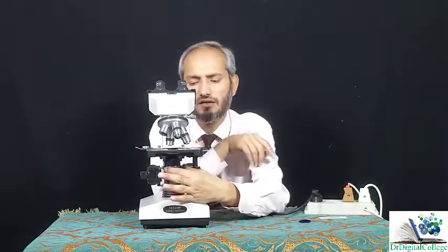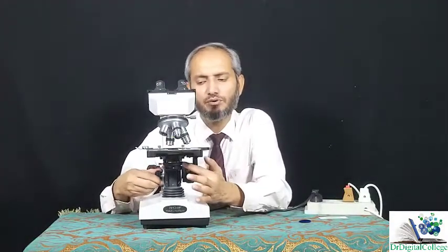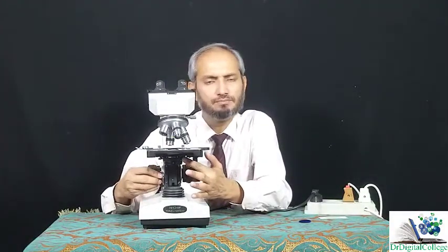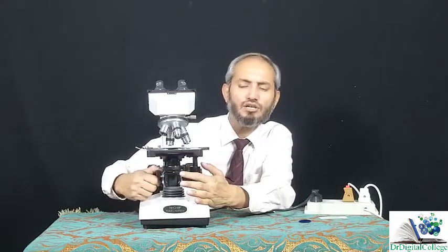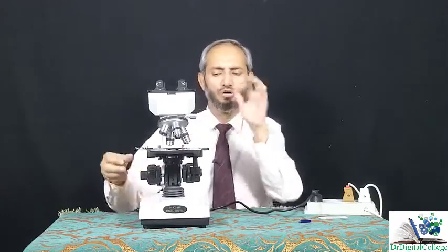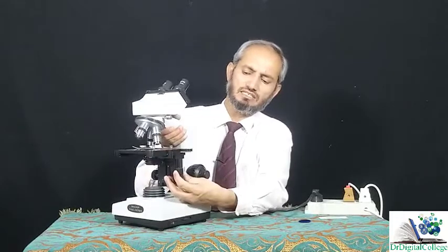For different magnifications, the position of this light filter should be different. Say for example, if you are observing something at high magnification, the high resolution can be achieved if you put the filter just near to your object. And if you are observing something at low magnification, you can have your light filter at a lower position. So at high magnification, your light filter should be near to your object.